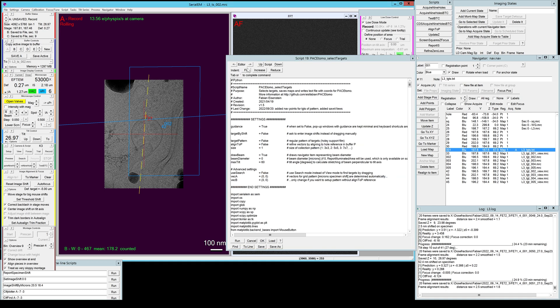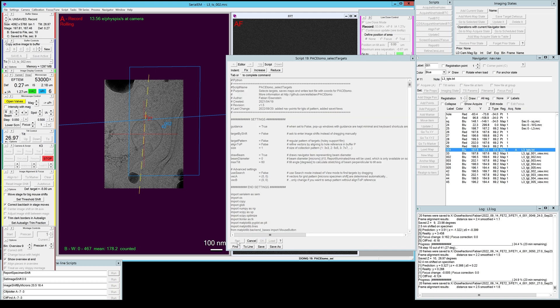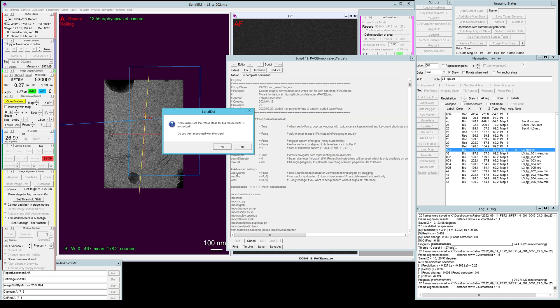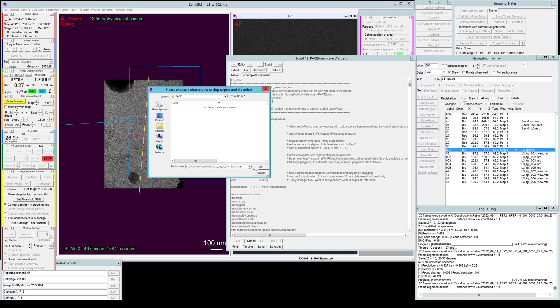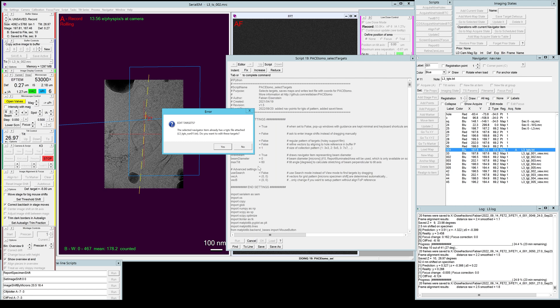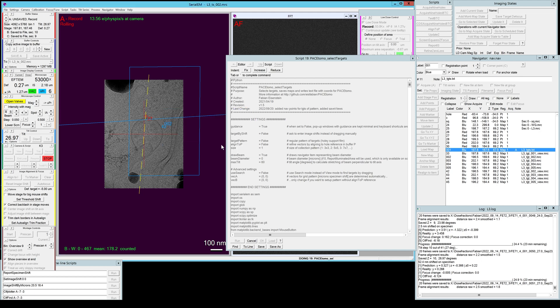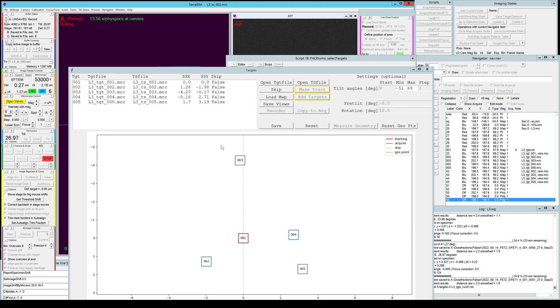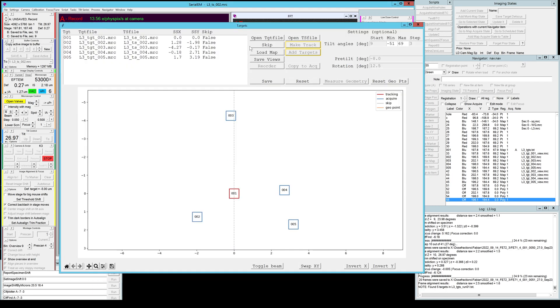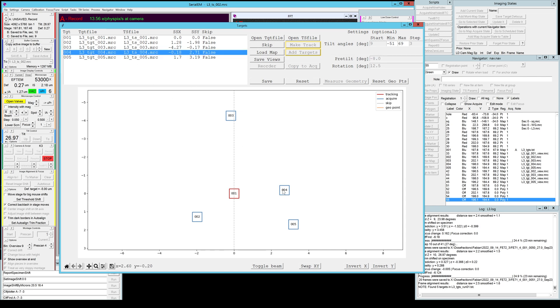We can actually go and run the select target script on our target file here. Let's do that real quick. And again, the typical questions, you have to select a folder and it will find the target script, but it won't find the original targets file. It will find a run file. So we can actually go in and edit the run file. And you can see some of the options are grayed out here that are not possible to change anymore.